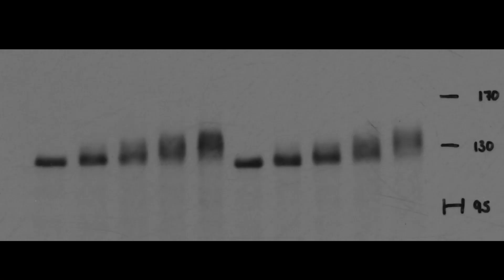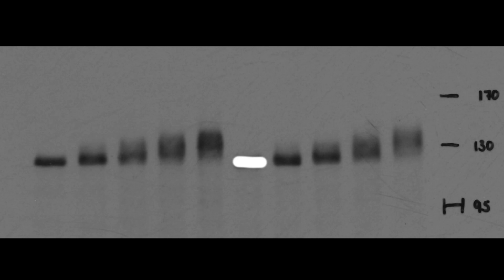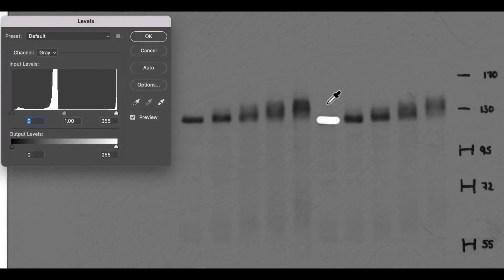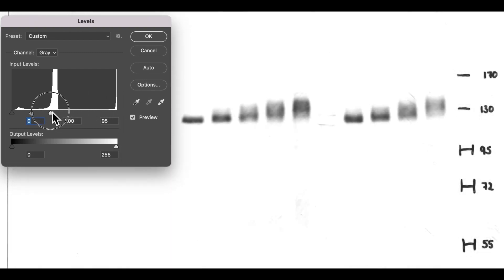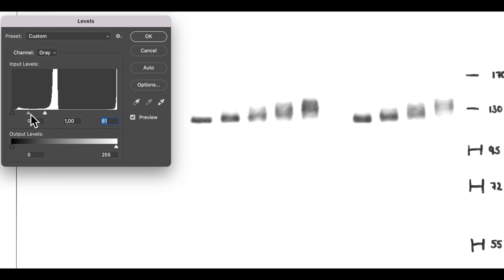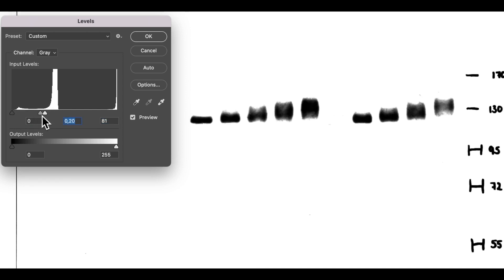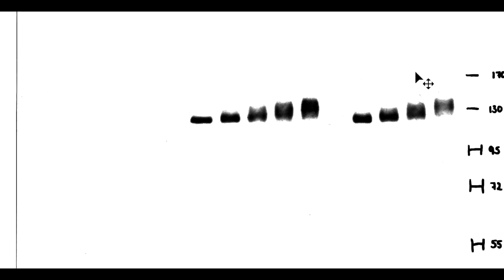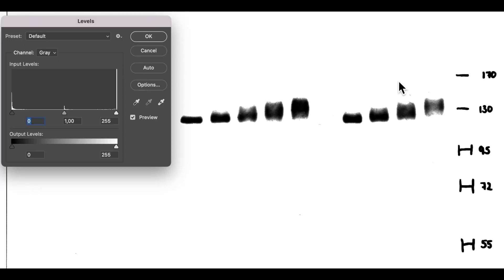In this example, one band has been removed with the eraser tool, leaving a white trace. The contrast is then adjusted to a level where the entire background disappears whilst the bands are retained. The eraser tool trace is no longer visible. Once the image is saved with these alterations, it is impossible to reverse the changes by re-adjusting the contrast settings, as demonstrated here.